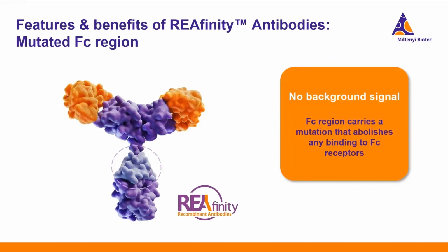By mutating the Fc region of the human IgG1, we effectively prevent its binding to Fc gamma receptors. This alteration ensures that the antibodies maintain their specificity for the target antigen without inadvertently interacting with Fc gamma receptors, thereby enhancing their utility in various experimental settings.